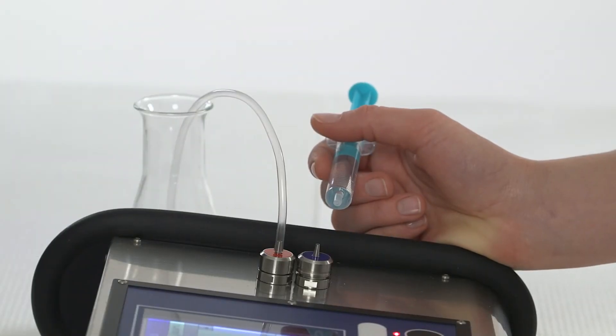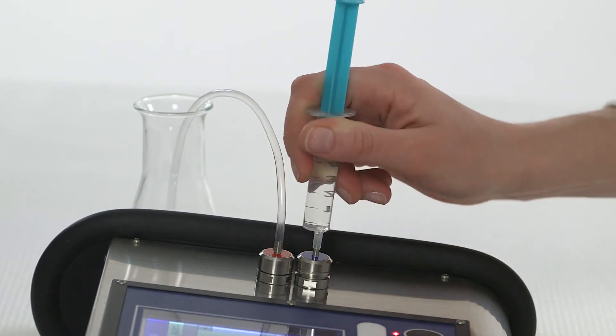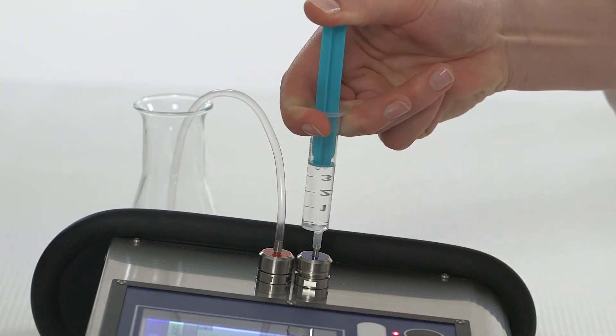At the end of an analytical run, clean the instrument with at least 15 milliliters of cleaning solution and rinse the system with distilled or deionized water.